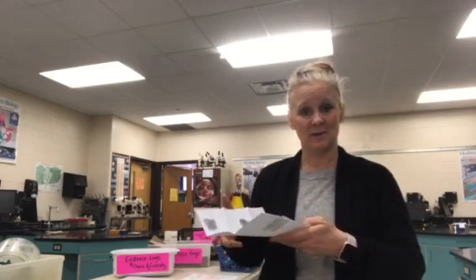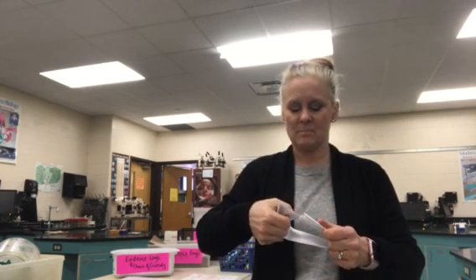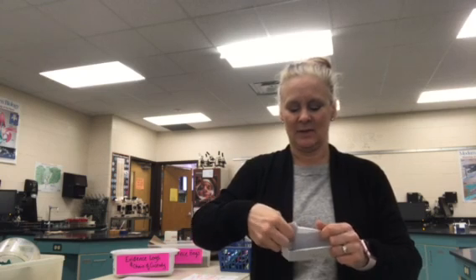If it's inside the bindle, once I do this and I put my evidence in there, and we're just going to model this by putting our lift in that by that X, I'm going to fold up my bindle. And then the thing that you do with this burrito portion is you're going to make a little envelope out of it. So you want to take one side and kind of shove it into the opening. So now it's like an envelope, and it's not going to pop open in the bag. Now it contains whatever evidence I put in here.